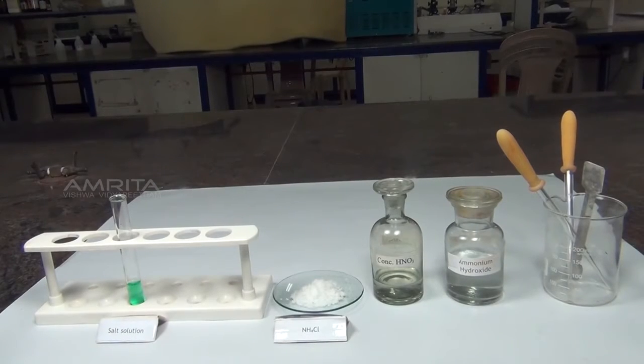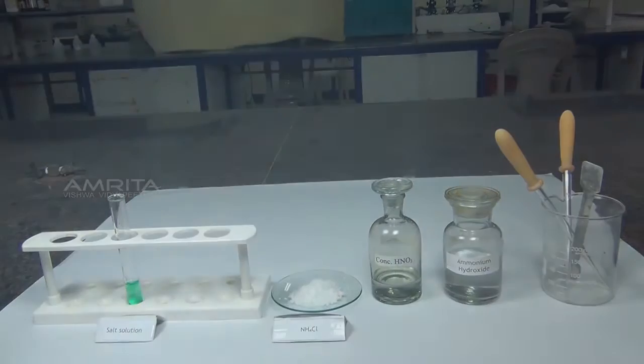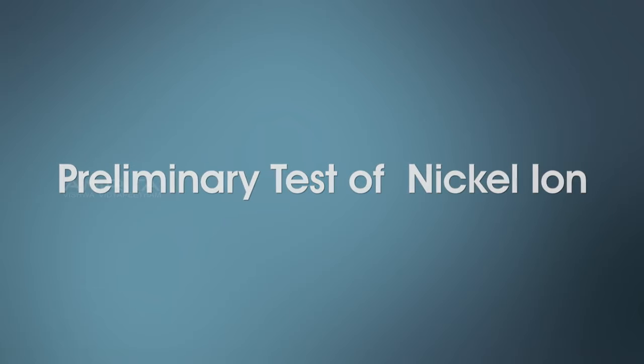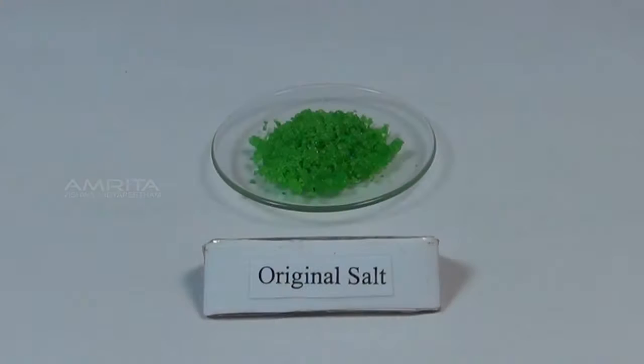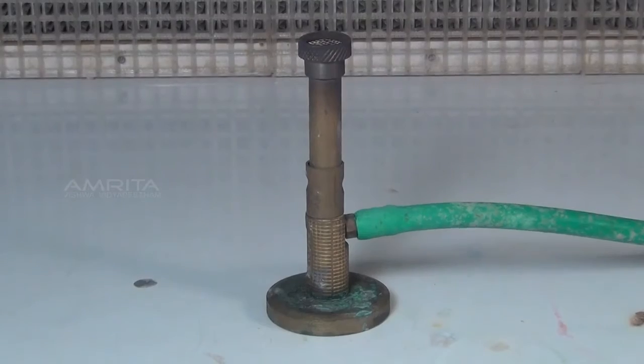Our aim here is to test for the presence of nickel ion in a given salt. First, we look at the preliminary test of nickel ion. Borax bead test. Materials required: original salt, borax, platinum wire loop and Bunsen burner.